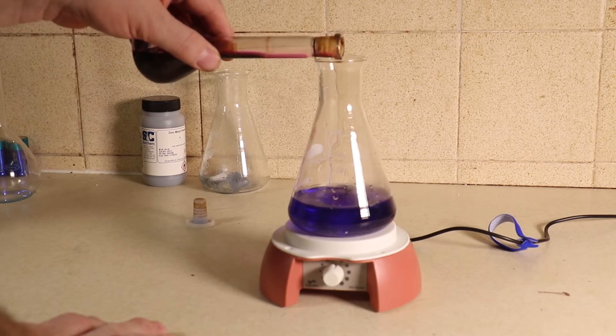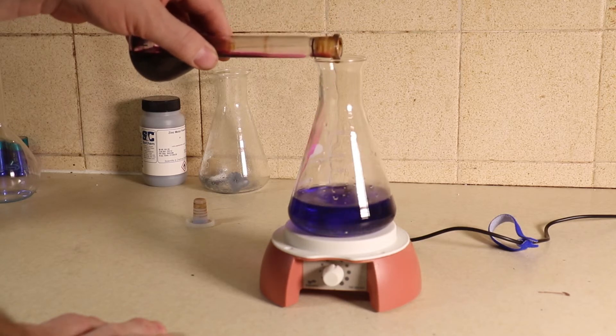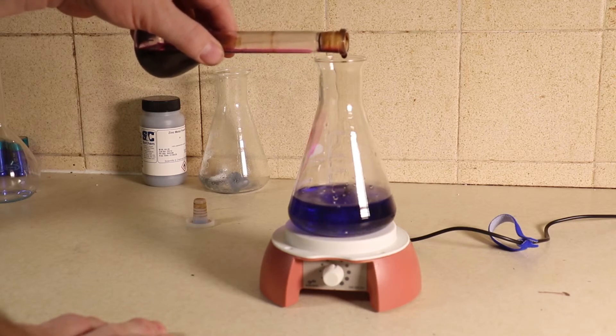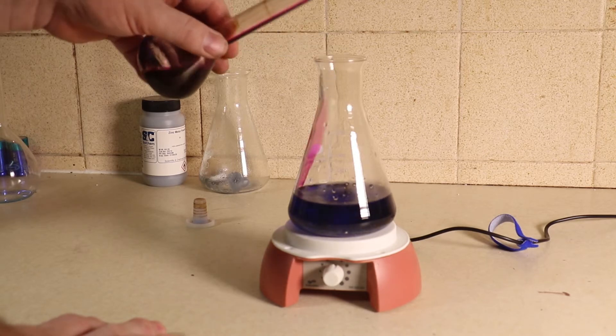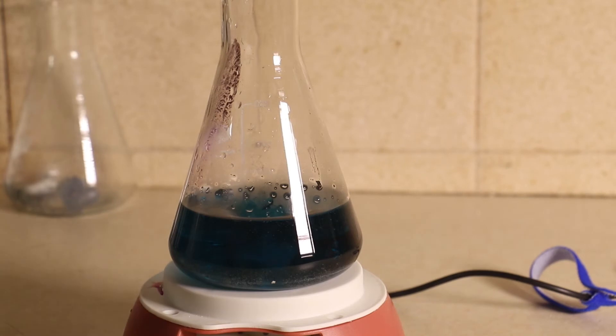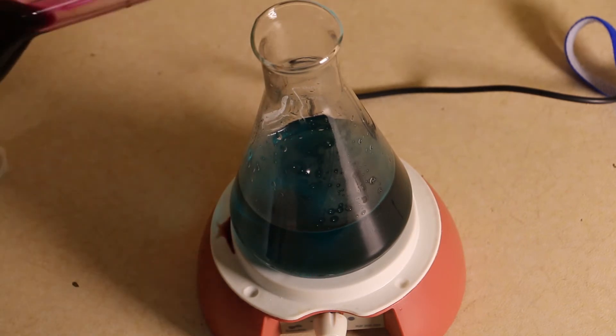I'm going to take some potassium permanganate and add it a little bit at a time. We've got vanadium 2-plus, and if I put a little bit of this in here, hopefully we'll go back to vanadium 3-plus. Let's add a little bit more potassium permanganate — I've made up a little bit more solution.